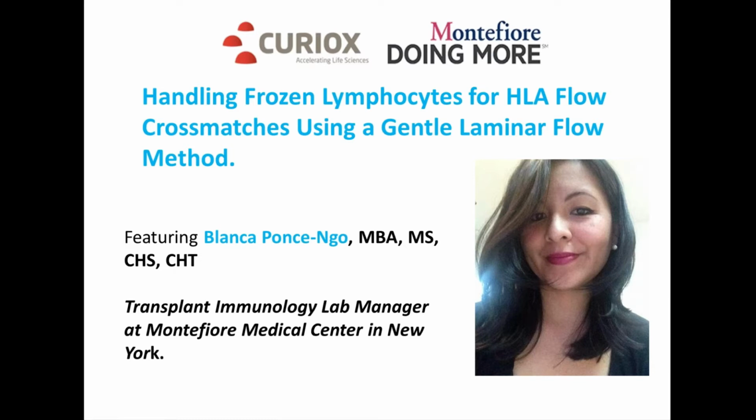The precision and turnaround time for flow crossmatches are some of the major factors we considered for a new technology. Our lab also just started participating in the NKR program. The NKR program allows for the exchange of living donor kidneys across the country by registering a pool of incompatible living donors. The program requires frozen cells to be used for all initial flow crossmatches.